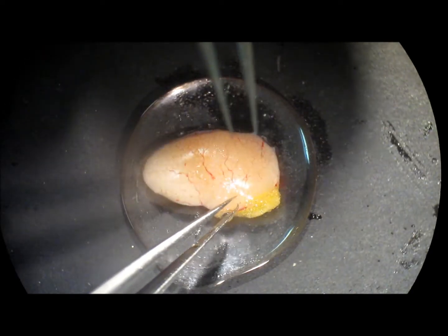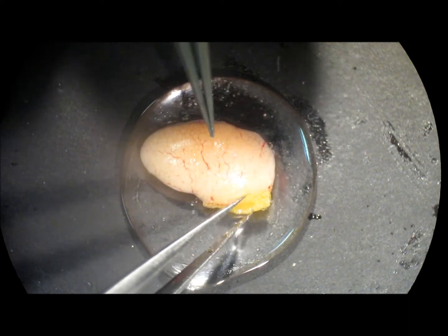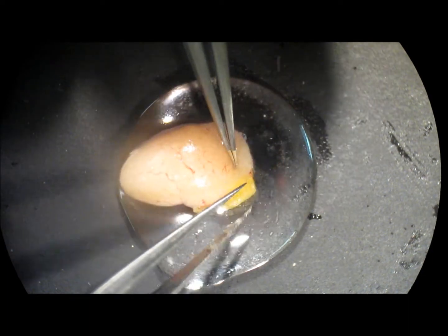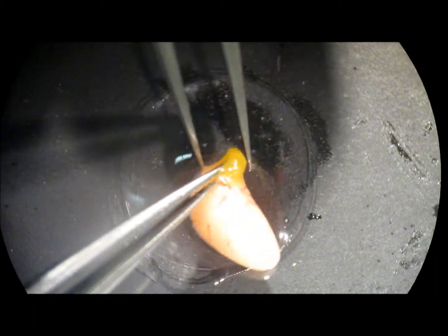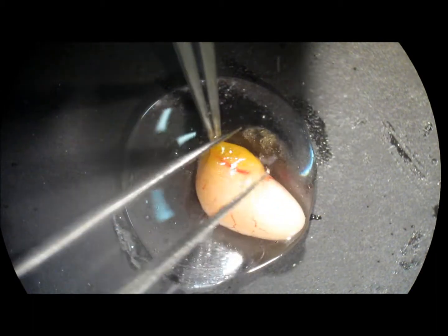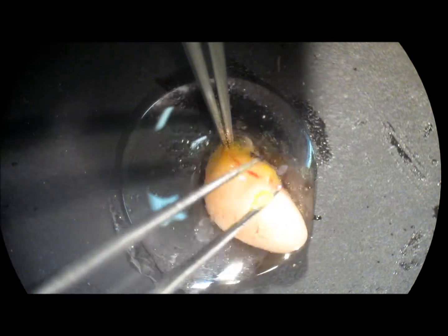Place the testis in one drop of 1XNPB. Clean out the testis by removing any remaining fat and connective tissue using number 5 forceps.